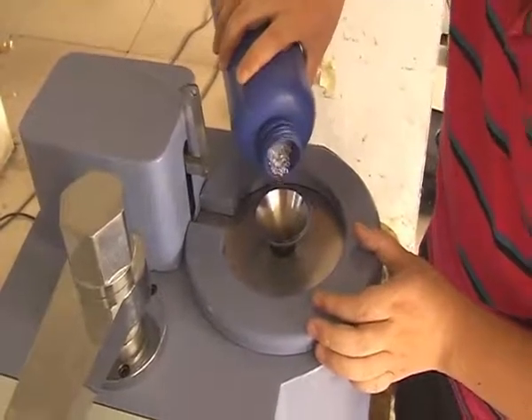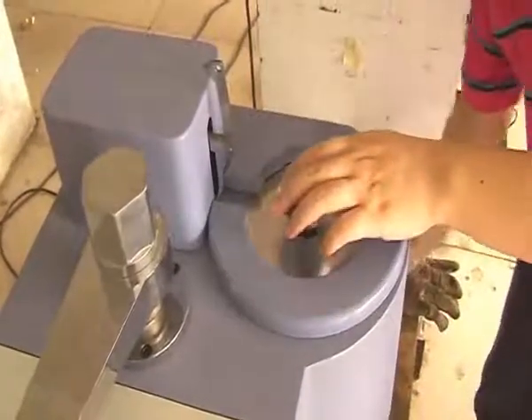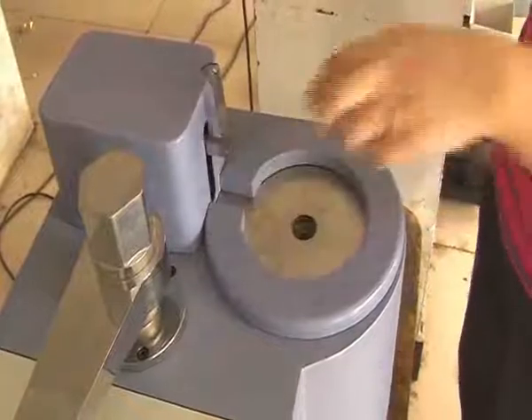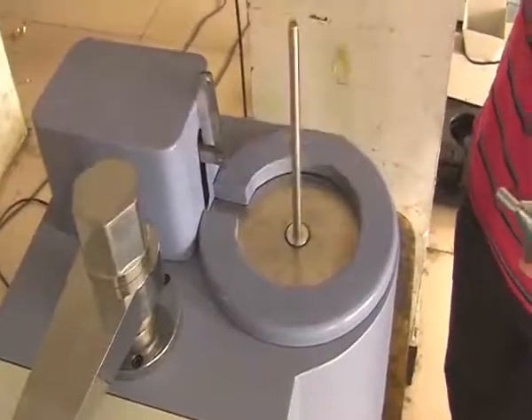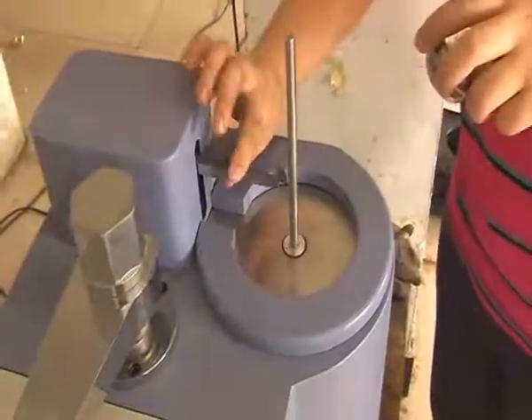Third, put in the load stem and take the pin back to horizontal. Last, place the basic weight. Please pay attention: the whole process of putting in the material must be finished within half a minute.